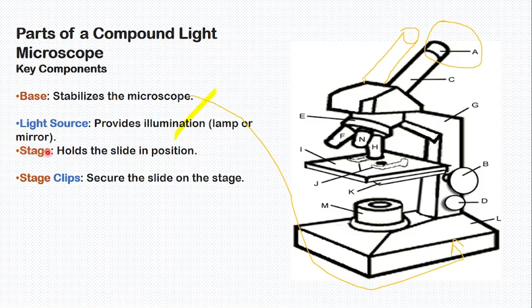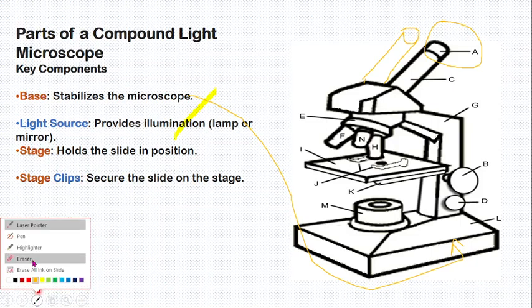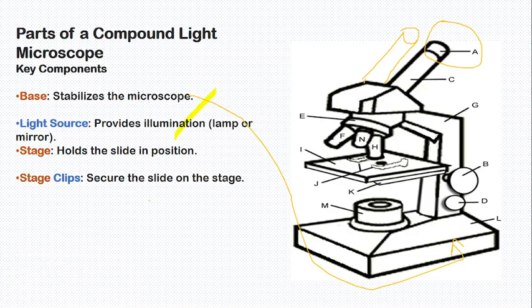Suppose this is a slide. On our slide we put a sample, maybe stool in which we suspect bacteria, and we place it on the stage.